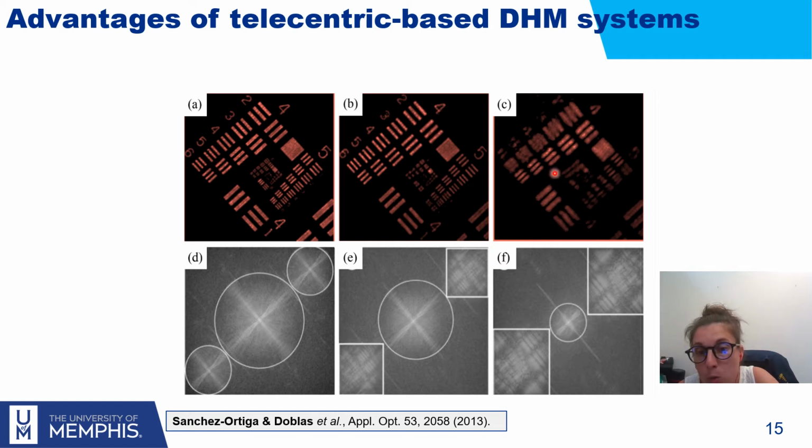But the moment that we further reduce the effective pupil of the microscope, it is probably the 5, I don't know if the 2 or the 1. But we keep reducing the resolution. So the system is no longer limited by diffraction, and that's not what we want. We want to have the highest resolution possible. So that's another disadvantage of using non-telecentric imaging systems.